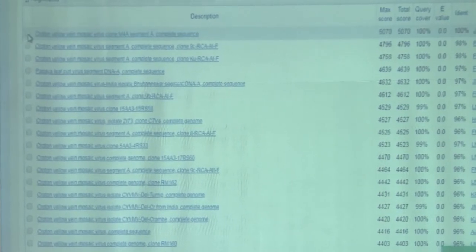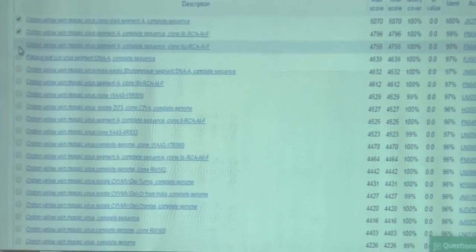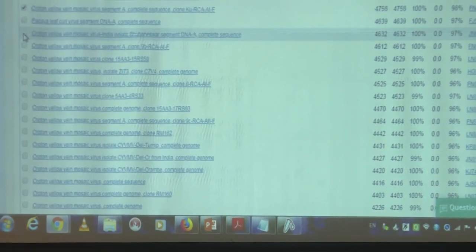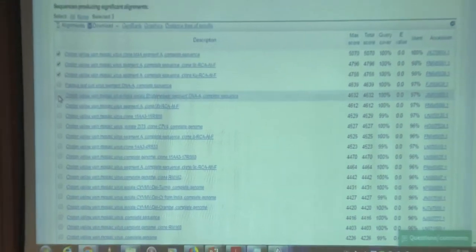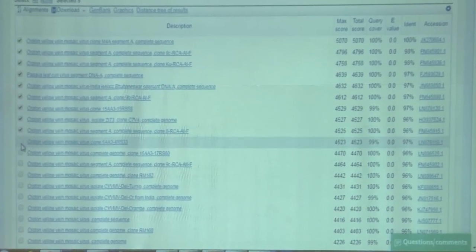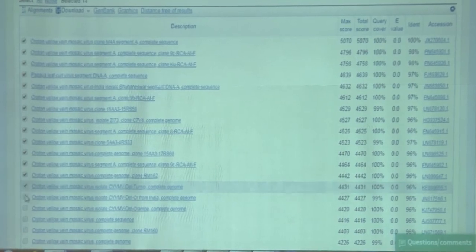You can choose the first 10 sequences, for example, but in your case you have to choose according to your intention, which sequences you should take. We already discussed that it all depends upon your objective. Suppose you are going for intraspecific characterization of isolates, then you have to hand pick the ones matching your expectations.